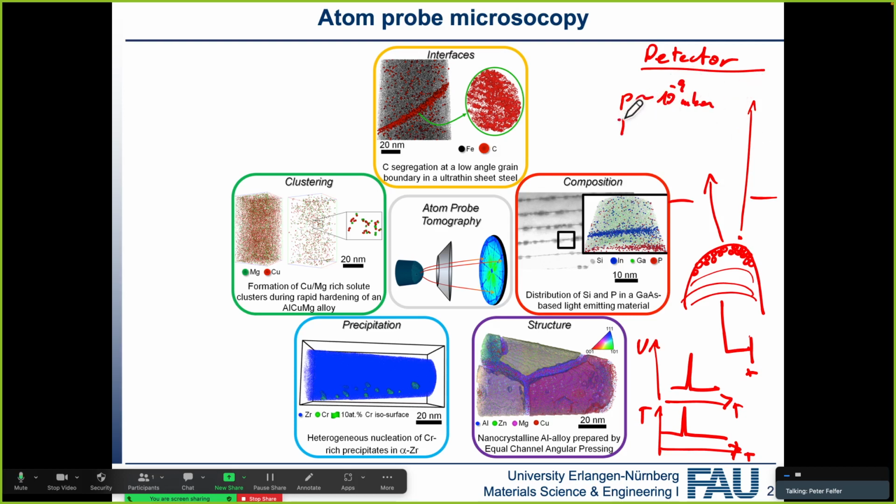And we need it to be at low temperatures. The temperatures are typically below 60 Kelvin. Sometimes we can work at higher temperatures, but typically we're below 60 Kelvin. And most modern machines can go down to 20 Kelvin, like our two machines that we have. People have recently done research going below 20 Kelvin, but then we don't see many advantages anymore. But we'll talk about that later.